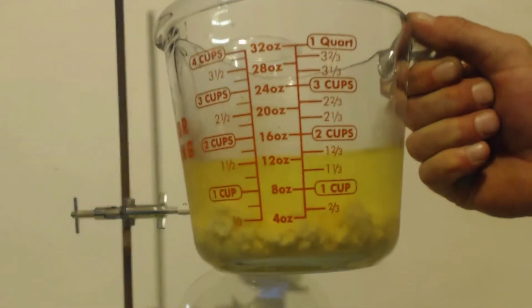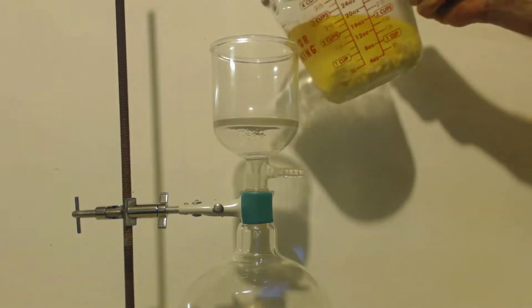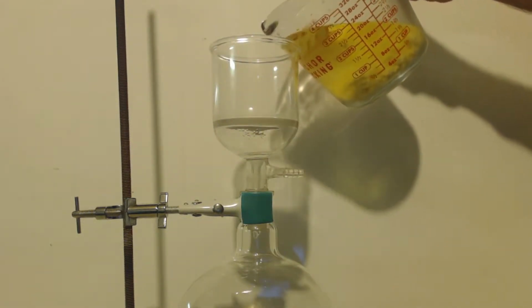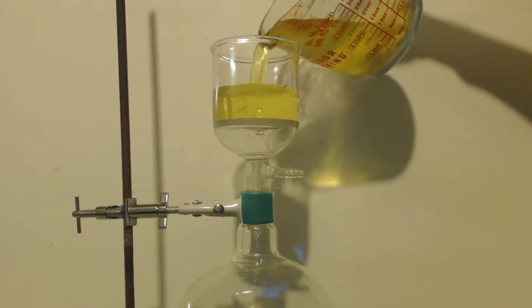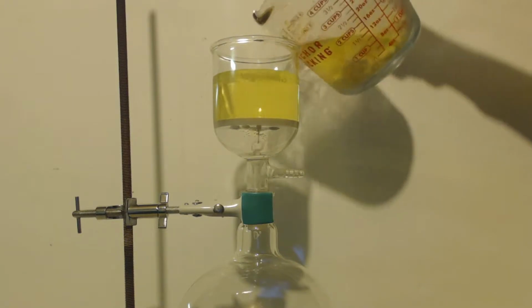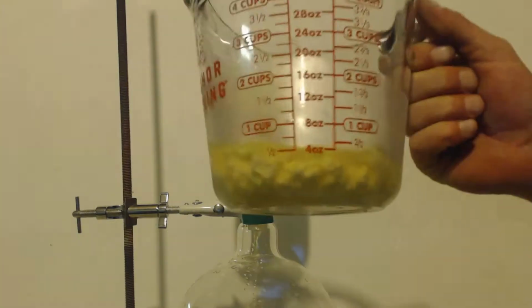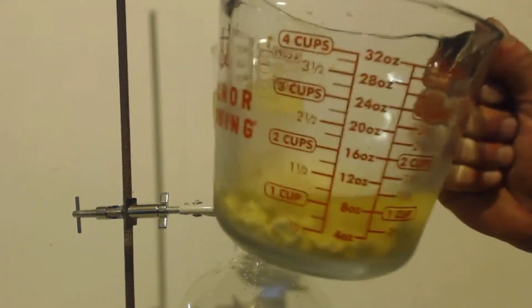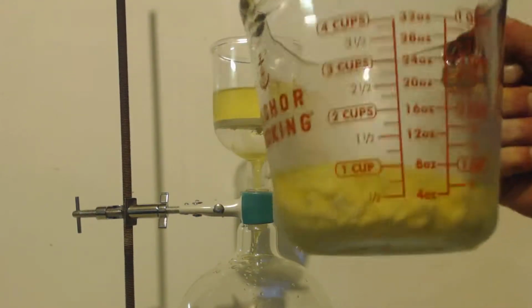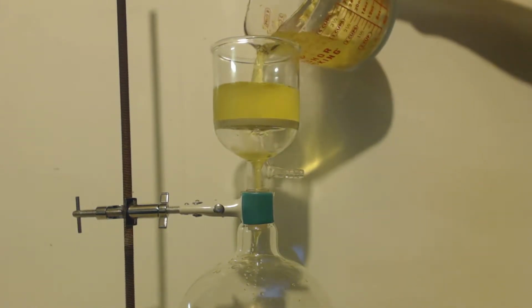Alright, there's all my product, all of it. I suspended it in 500 milliliters of cold water and put it in the refrigerator for a while. Now I'm going to filter it. Guess I should have just poured that off into another container. Anyways, that's dripping. I suspended it in 500 milliliters of cold water, and you could probably just do it for an hour or two. It's actually been sitting there probably for a couple of weeks because I forgot all about it. I've been doing other stuff.